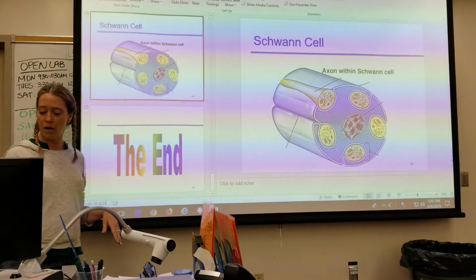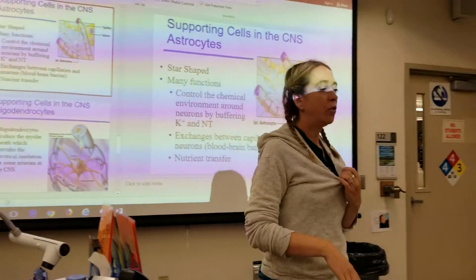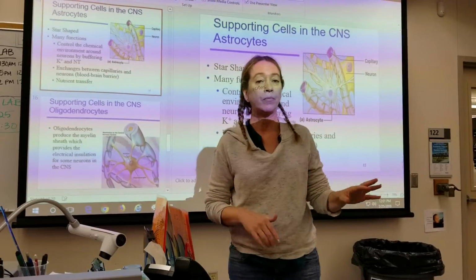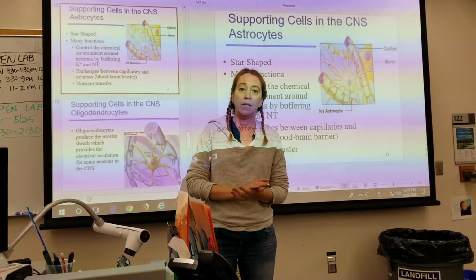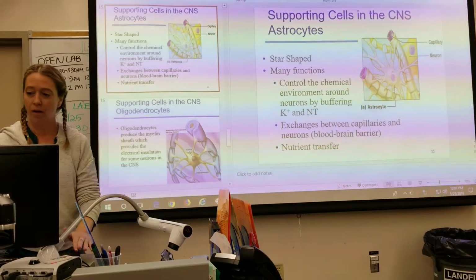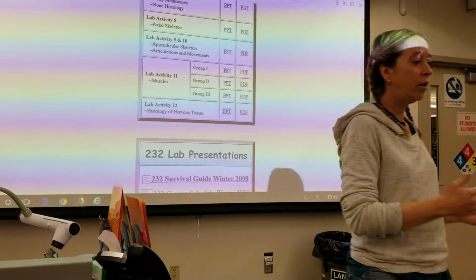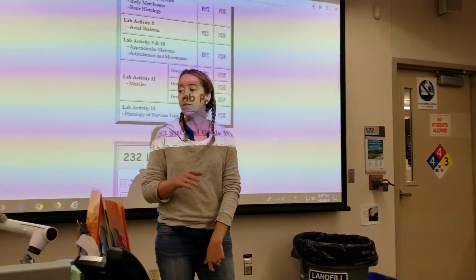The last, they didn't put satellite cells on there. Let me just look and see if we have to know those. So there is one more group. Satellite cells are in the PNS. We don't really know what they do, okay? But they're in the PNS, just so you know, just in case it comes up. All right, I want to make sure that you, there is another slide.